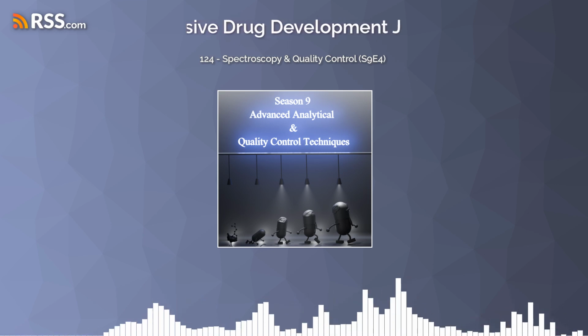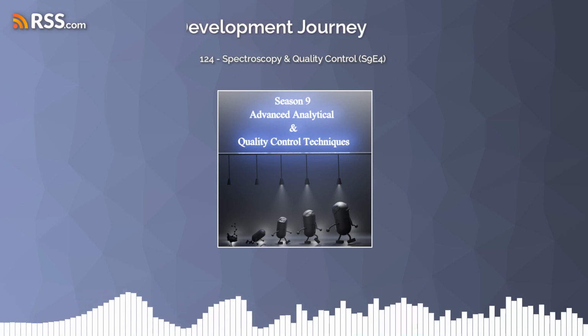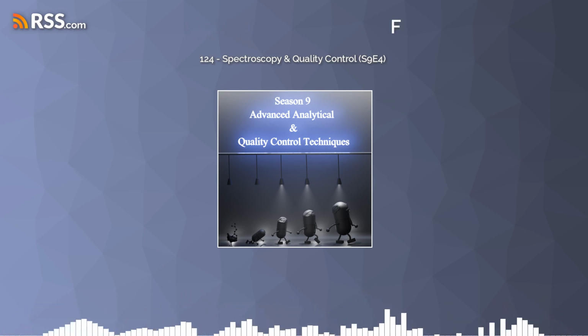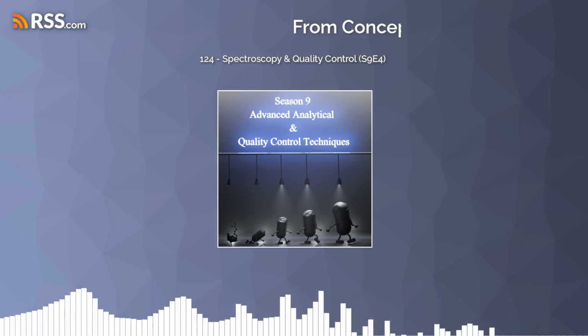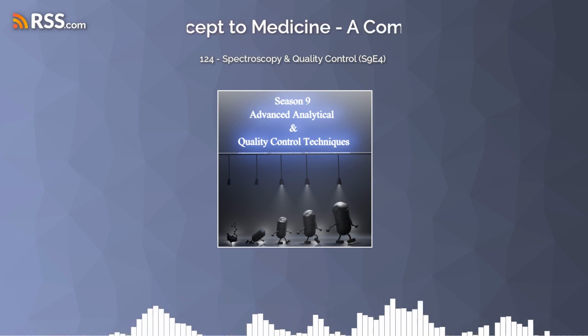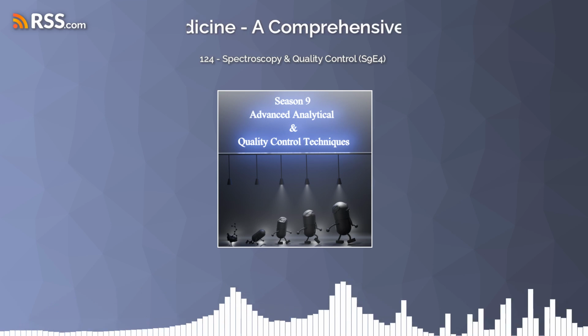So it's like a feedback loop for quality control. Exactly. Real-time quality control right there in the manufacturing line. That's incredible. Yeah, it's a really powerful technique. Okay, so UV-Vis, IR, Raman. Now we've got to talk about NMR. Nuclear magnetic resonance.